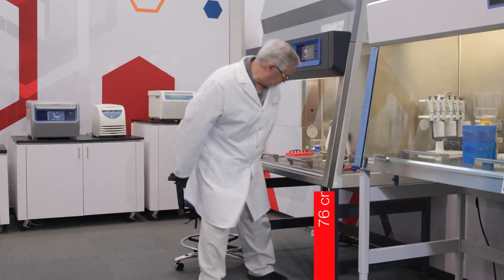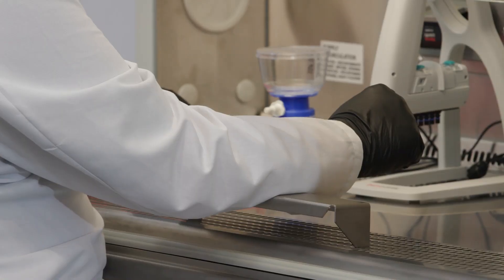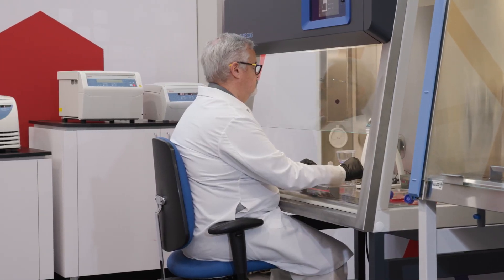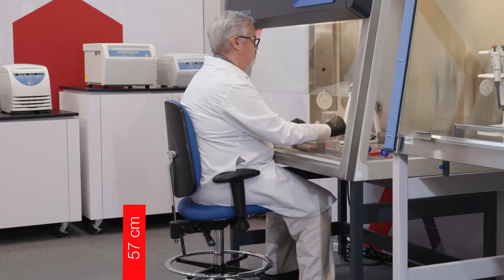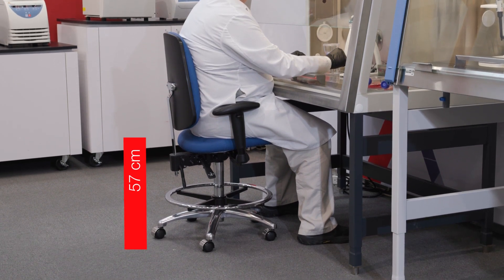The work surface is set at 76 centimeters above the floor. His forearm is parallel to the ground and resting on the armrest. His elbow is angled 90 to 120 degrees. His feet are flat on the ground. His chair is at 57 centimeters. His thighs are close to horizontal with the knee angled at 90 degrees or more.